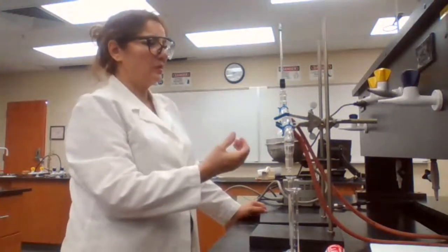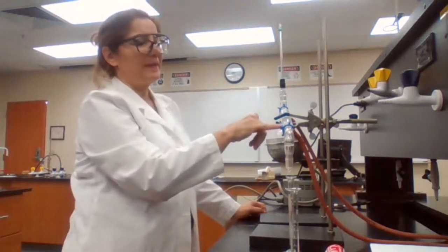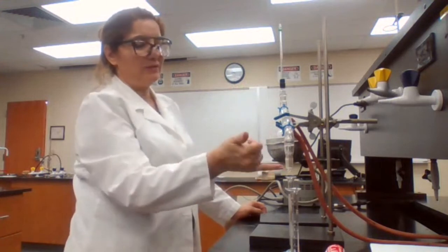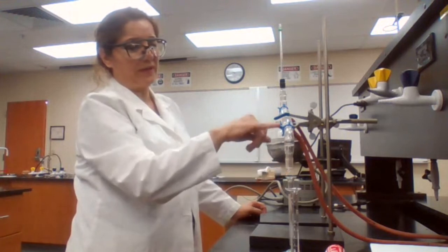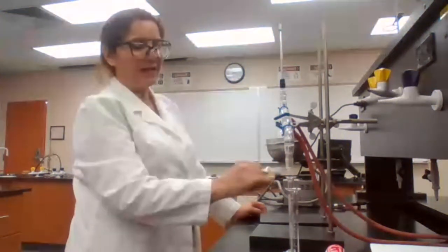But in general, if too much vapor comes through the condenser and doesn't get a chance to condense to liquid, you would see vapor coming up to the end of the vacuum adapter that I have for collections.